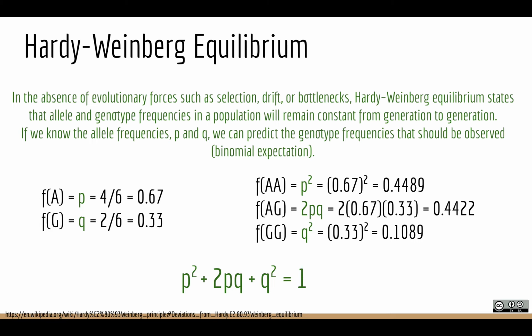We'd have to do further research to study that. But deviation from Hardy-Weinberg equilibrium is a crude attempt at looking for things like selection, migration, bottleneck, or it's also a quality control measure. You could have sites in the genome where it's hard to genotype accurately, so you get this deviation between the apparent allele frequency and the observed genotype frequency. So it can be used as a nice quality control measure.